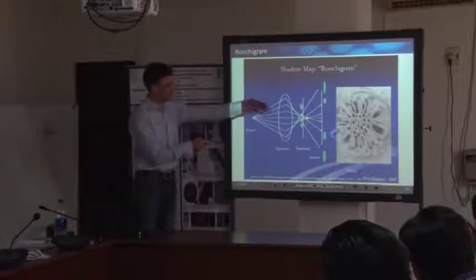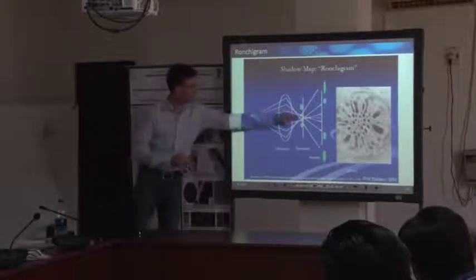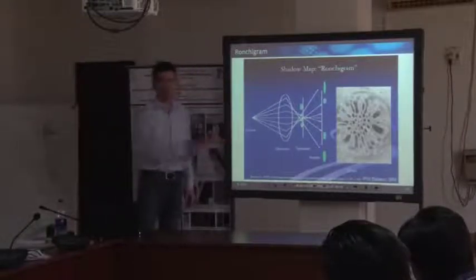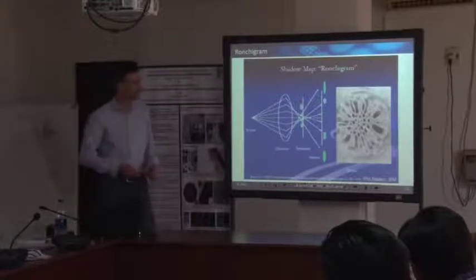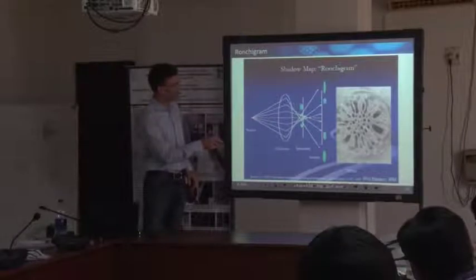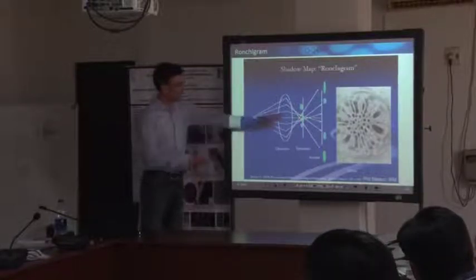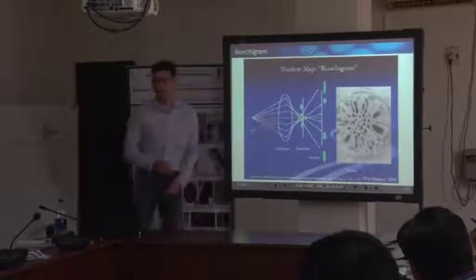In principle, this is the inner part of the probe. It's just these inner rays here that contribute, and all the others, this is what you want to cut off. This is just the tail. But if you follow the electron rays that pass through the sample, what you will see is that from here to there, and from here to there, you get some inversion of the image.